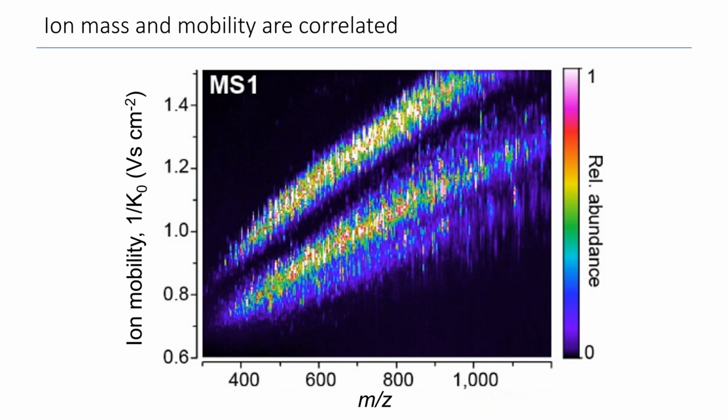And you can already see a few features here. One of them is that the singly charged ion population, the one on top, is very well separated from the multiply charged species, which is the bigger cloud in the lower part of that panel.